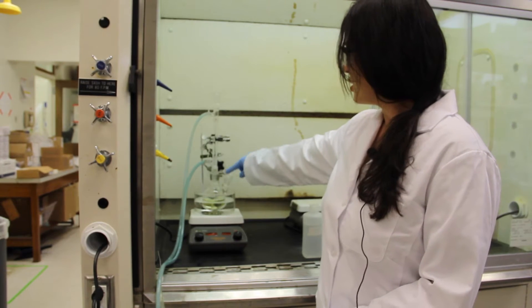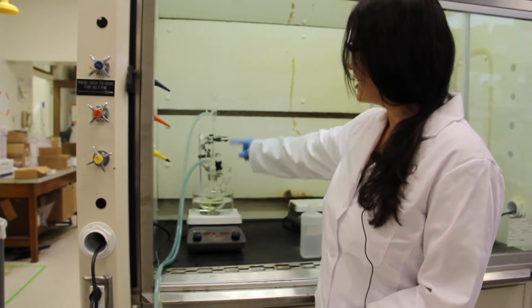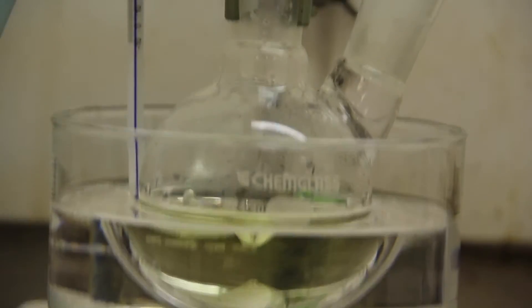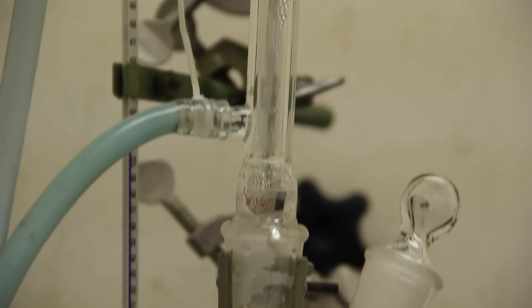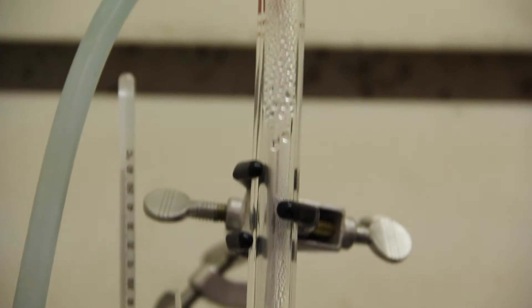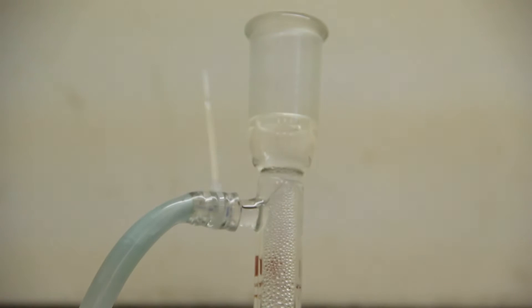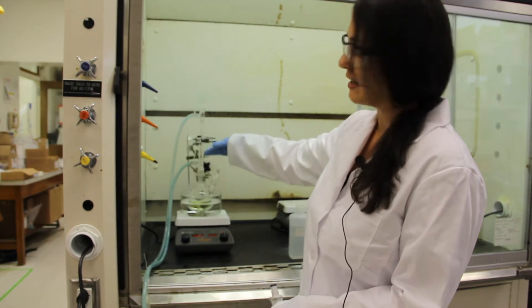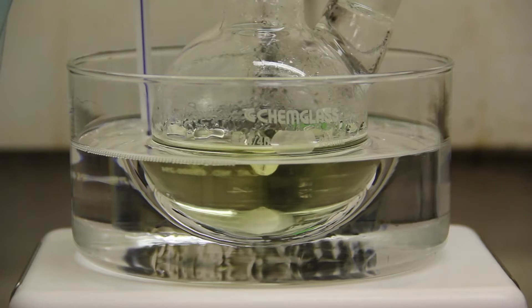Attached to the round bottom flask we have a condenser, and through this condenser we are flowing cold water so that when the water which is being heated evaporates into the condenser it reaches a cooler temperature and then is condensed back into the solution.